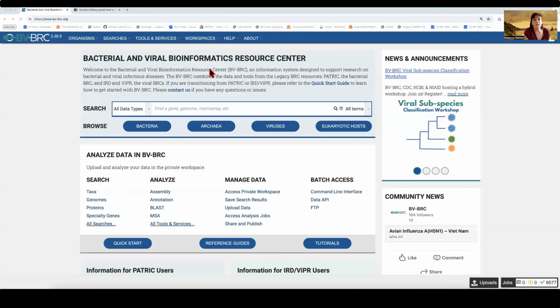In our last video, we submitted a taxonomic classification job using a read sample that came from a study where they had collected samples from people who had had an orthopedic replacement, like a hip or a knee replacement, and had had a bacterial infection. Now, these infections can be really serious because the bacteria can cluster around the new joint and they're sort of shielded from the immune response.